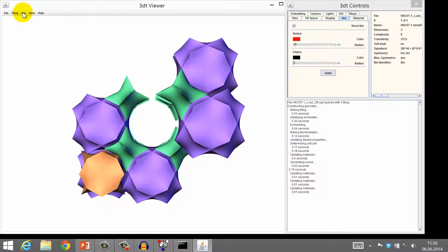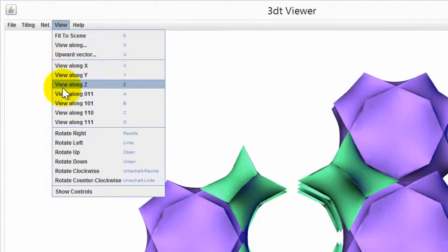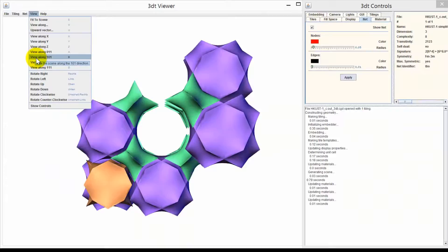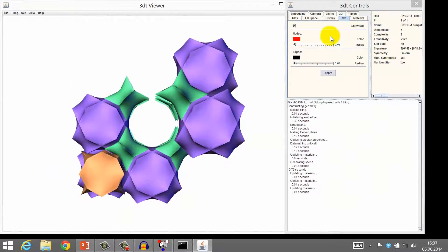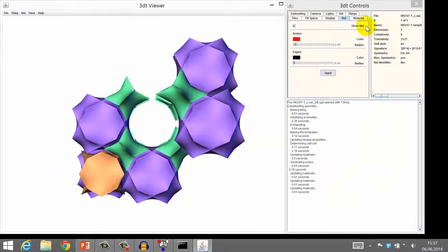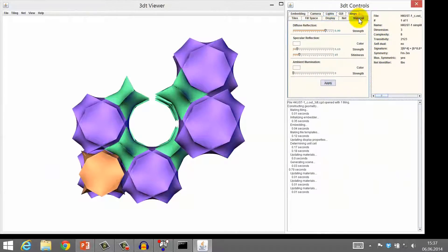You are probably familiar with the options from the View tab, as they are very similar to the corresponding functions in Vesta and Mercury. In the Controls window, we can modify the scene and change, for example, the lighting or the material of the tiles.